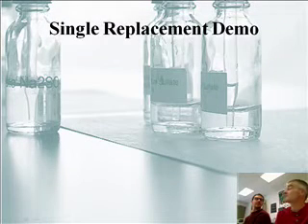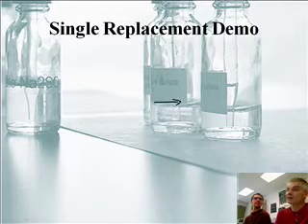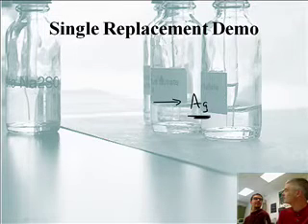And we forgot to finish this one, actually. That was pretty cool. So you got just silver, actual silver coming out of a solution. One thing that's very cool about these reactions is you tend to get these precious metals in their pure form out.